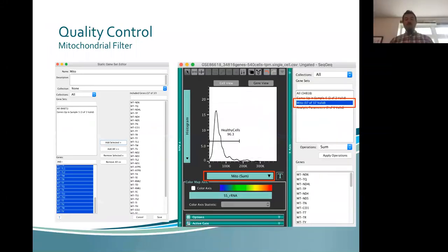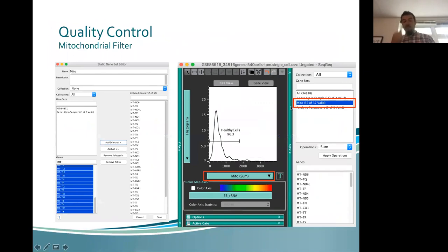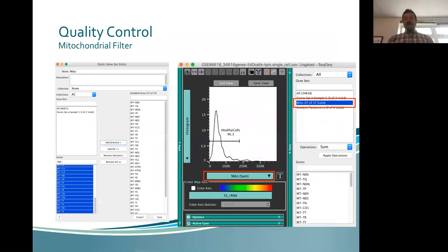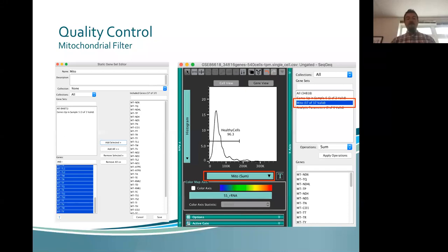Another method of quality control is to remove cells expressing highly in mitochondrial genes. We can set up a gene set containing only mitochondrial genes and remove — in this case — the 3.7% expressing the highest amount of mitochondrial genes, ensuring we have healthy cells not expressing too many mitochondrial genes, which might indicate cell damage or death.